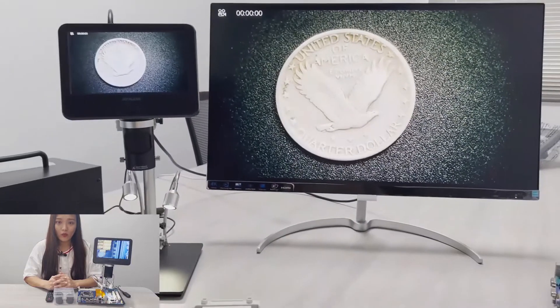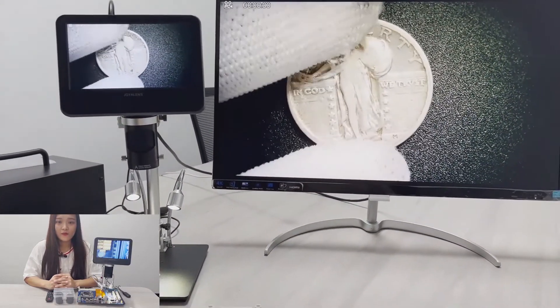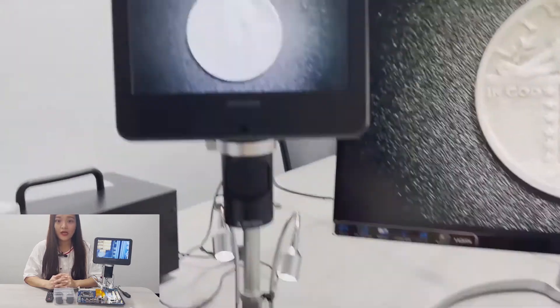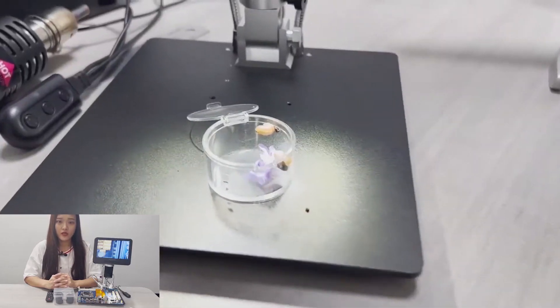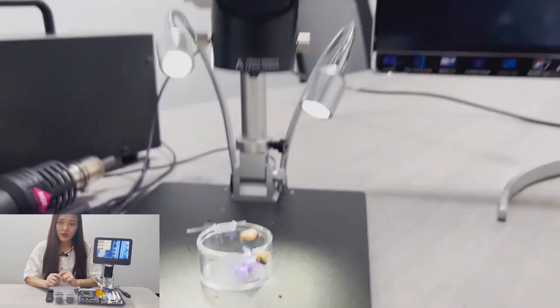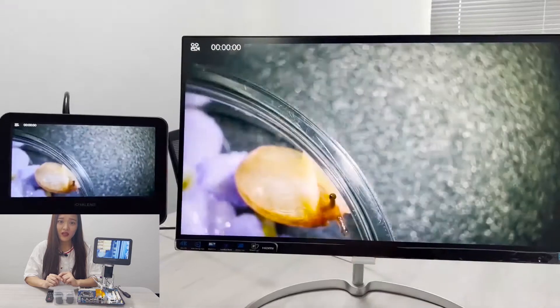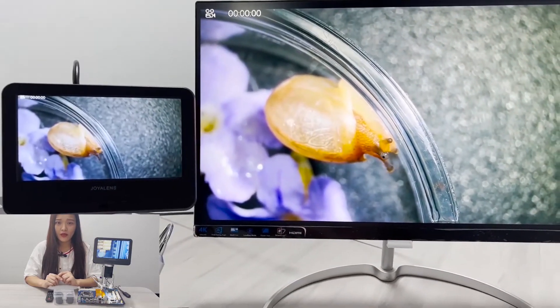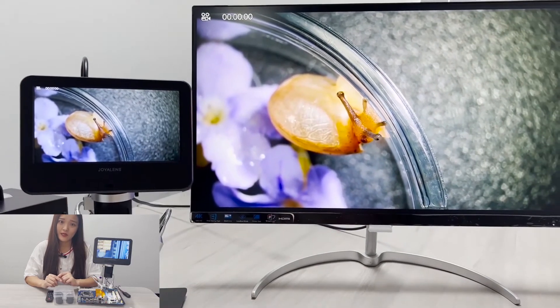This is how Lens A works. I changed the specimens just so you could tell how different colors, sizes, and materials look like under it. By the way, the 246S is the only model we have that can display both on an external monitor and its built-in monitor at the same time.